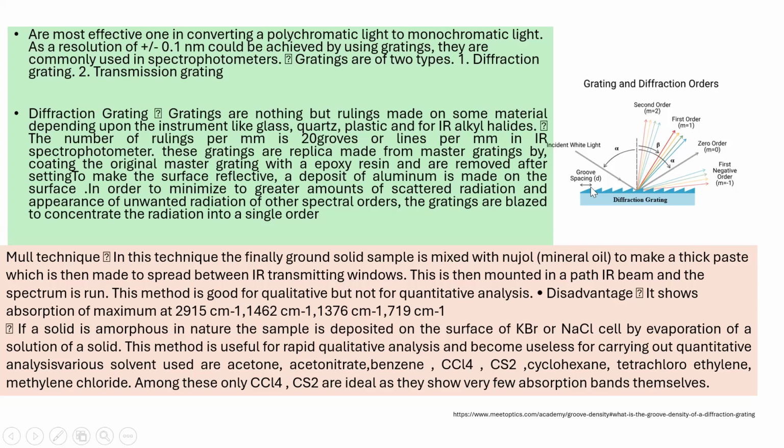Can you imagine? So finely designed, so whenever light falls onto it, it is going to get broken down into its component wavelengths. Of course, more details are there to talk about, that is what is zero order, negative order, first order, but these are very technical details. It is just to touch the term. I have put it here in the slide. If you are interested, we can talk about it in detail, but from an exam point of view, not more than the basic information about diffraction gratings needs to be talked about.